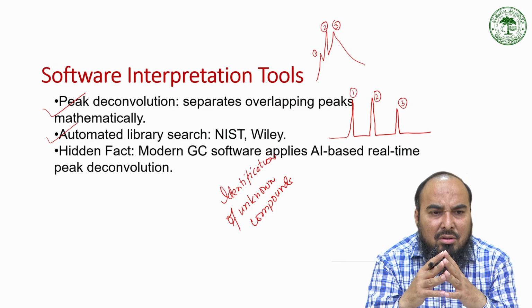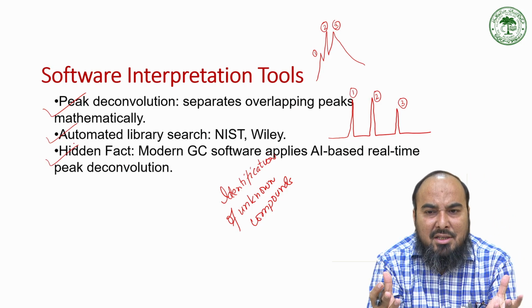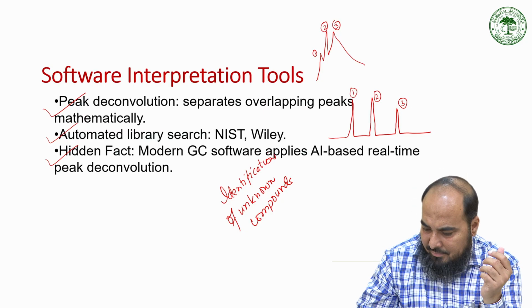So you are using artificial intelligence to get a real-time picture of your chromatogram.